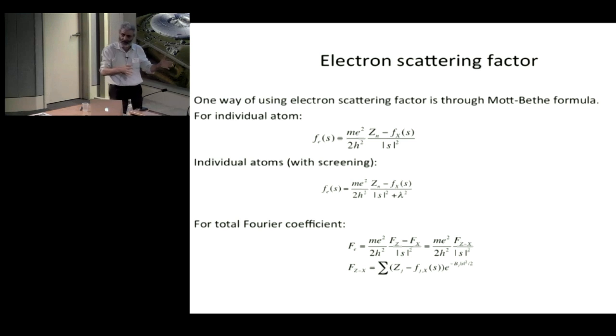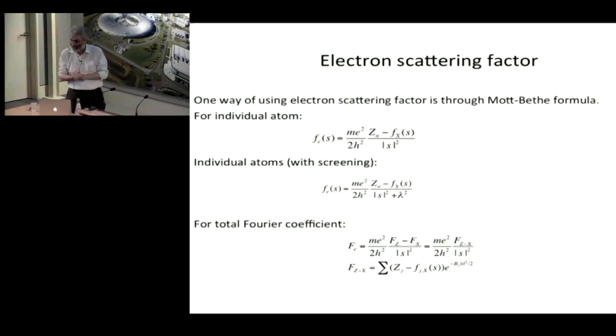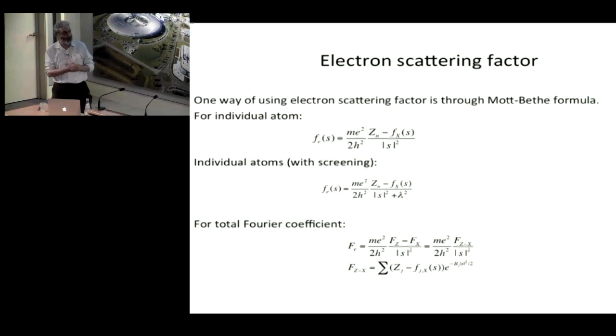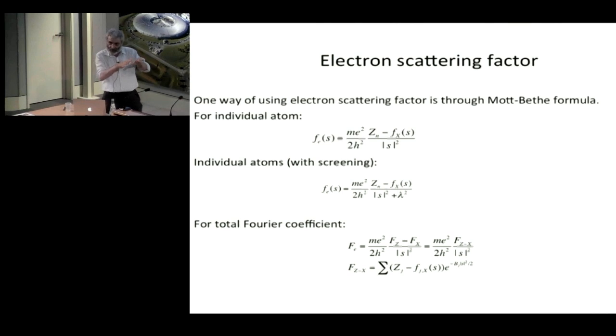In crystallography, it would mean that it would be impossible to observe crystallographic data, which is not true. We know that it's possible. We observe that, and in EM, it would mean that the molecules would affect each other, and observations would be extremely difficult, and the electrostatic potential would be very flat, but it is not like that.